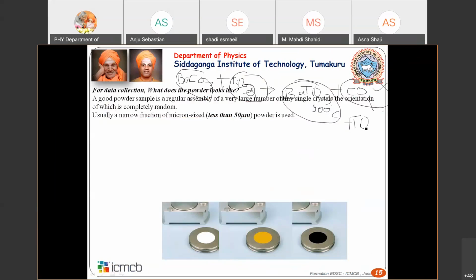Okay, so once you start heating at a higher temperature and for a longer time, maybe at 1200 degrees C for maybe 24 hours, then after that if you take your XRD, you will not see any of these carbonate byproducts. You will see only pure barium titanate.